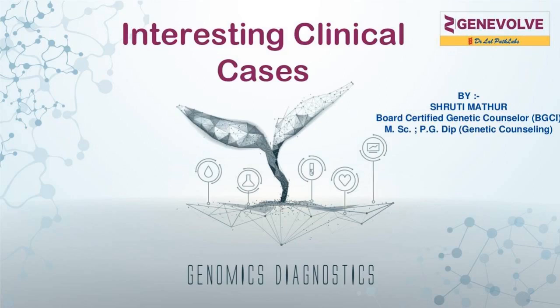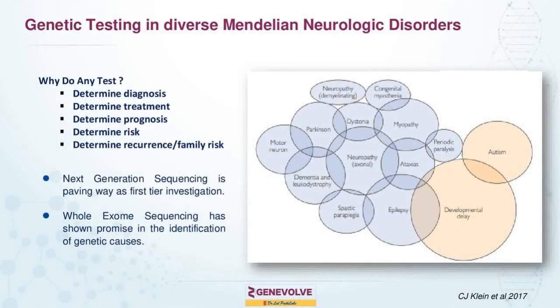To start with, just a general slide overview, taking the example of the neurology segment. If you can see on the right side, it mentions the overlapping features that we tend to observe in different clinical categories in neurology. As such, you can see dystonia, development delay, ataxia, epilepsy. They all tend to have overlapping conditions and symptoms. So whole exome sequencing can play a crucial role instead of single gene or even targeted analysis.